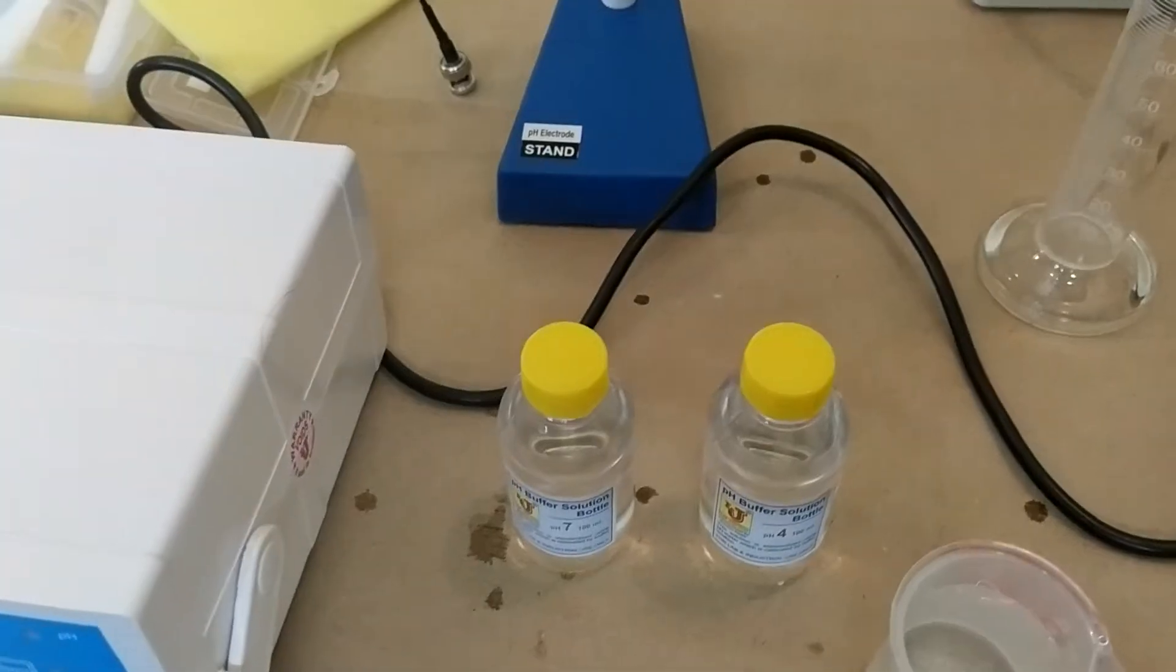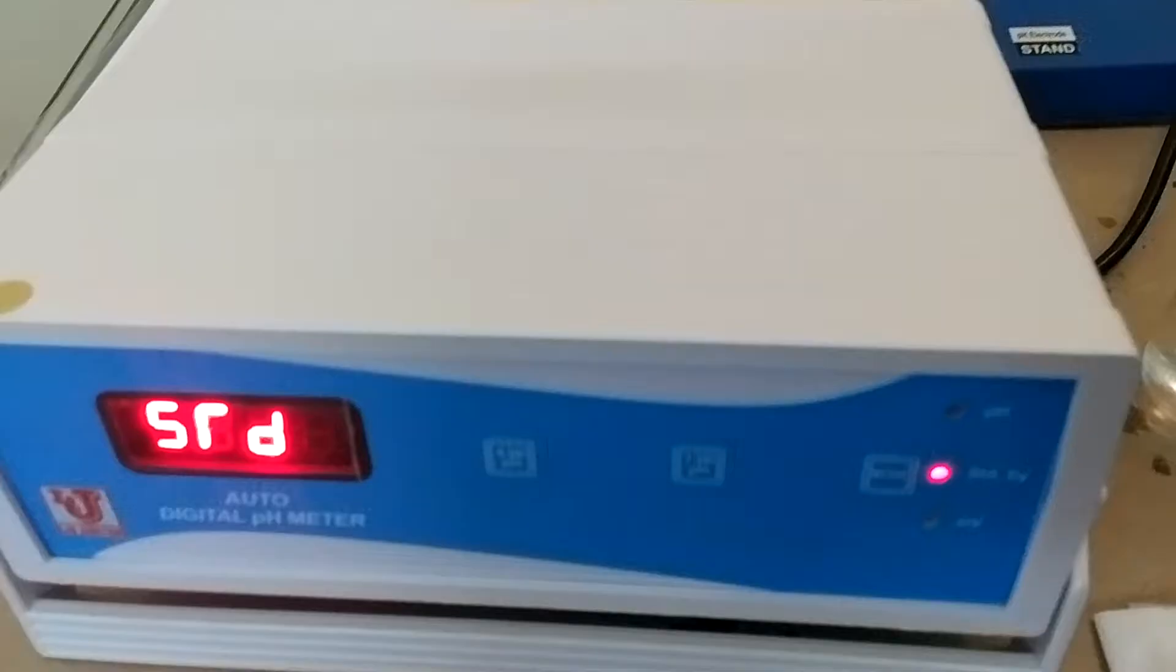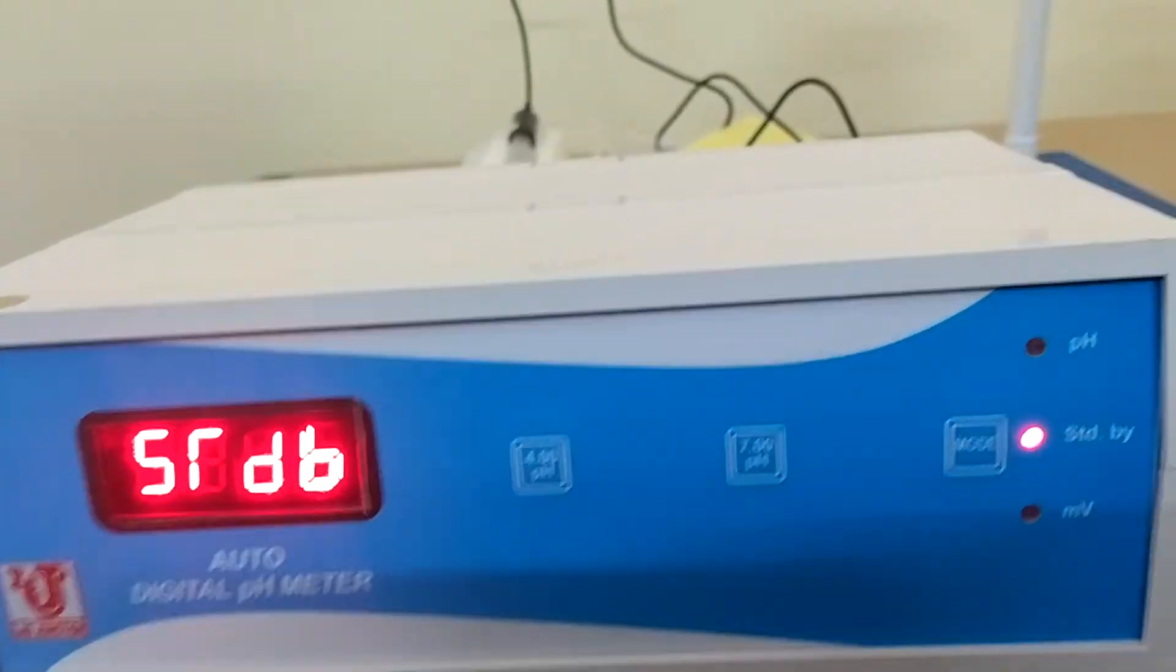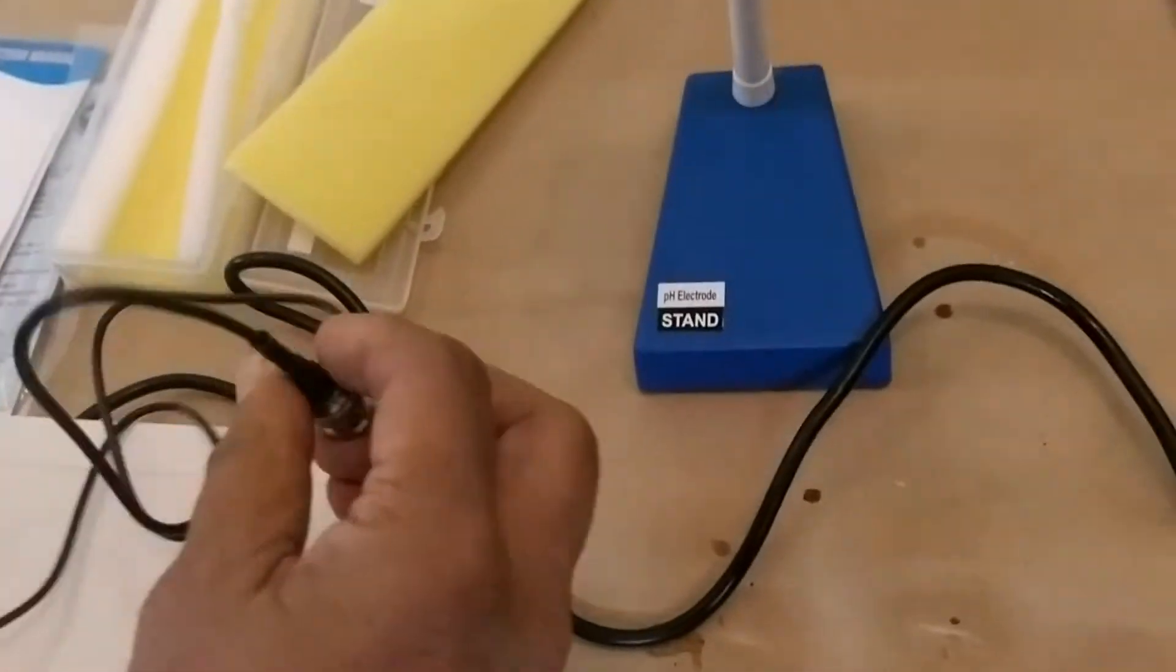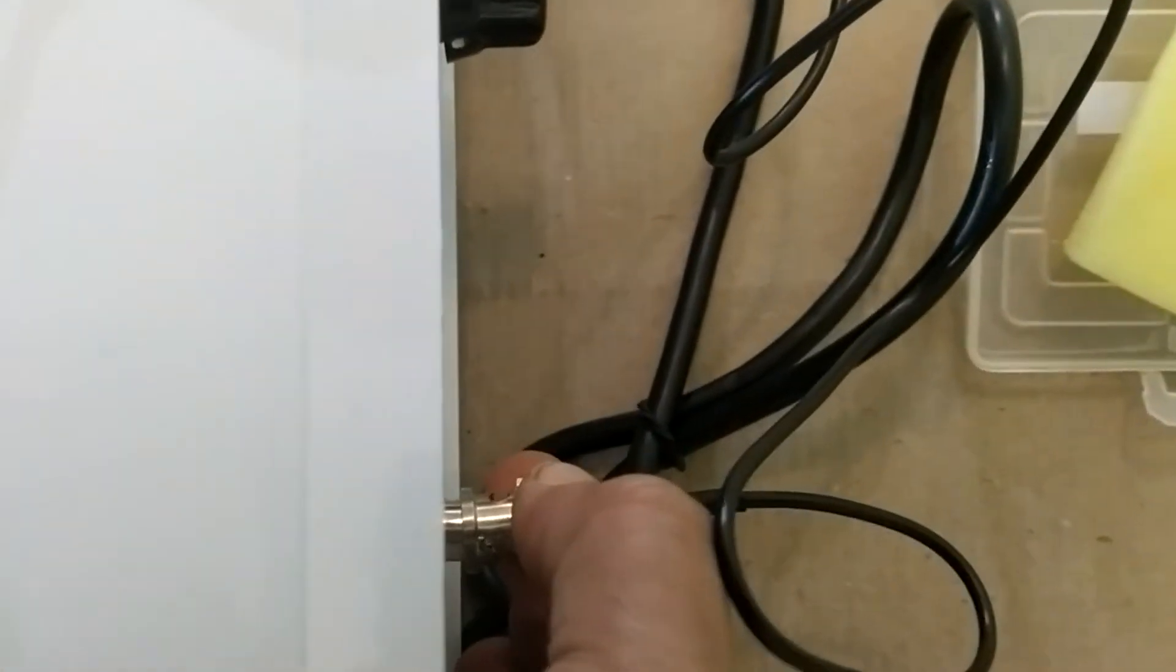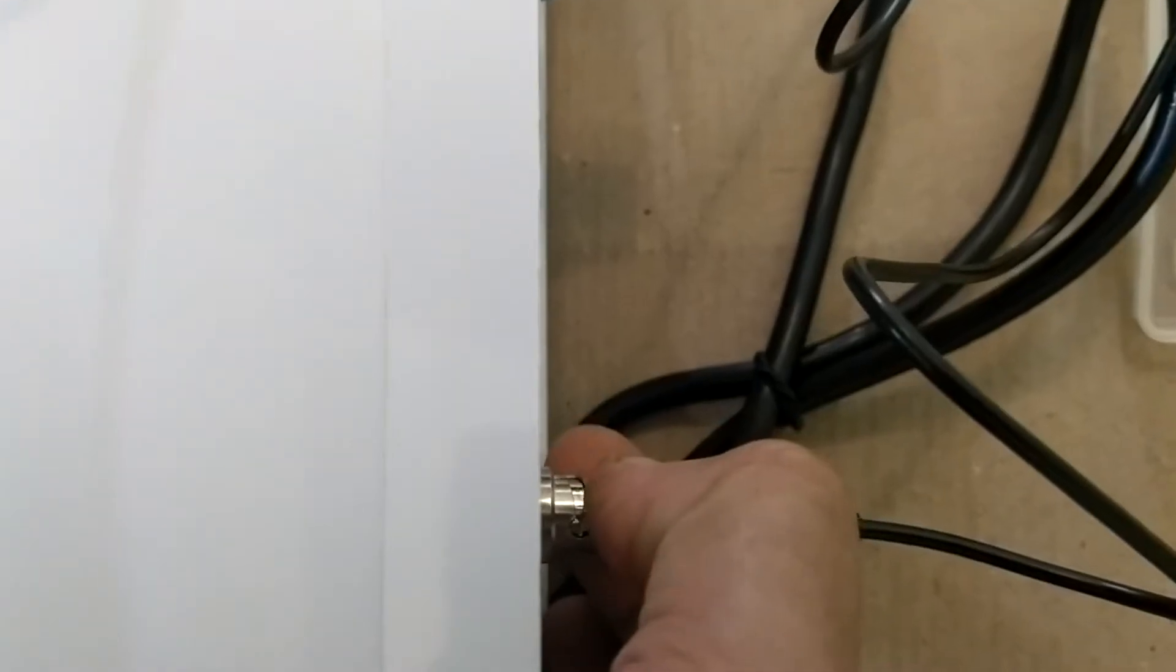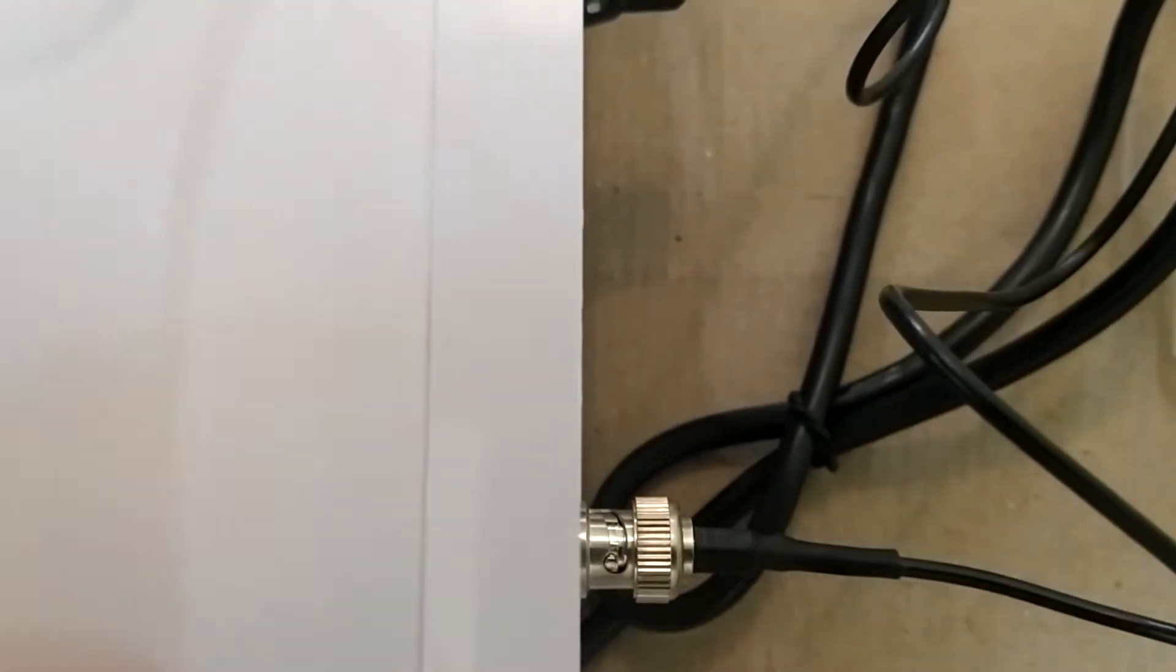Now switch on the instrument. It shows standby mode. Now take the pH electrode and connect in the back side. You can push this and twist. Then it can lock the BNC circuit.